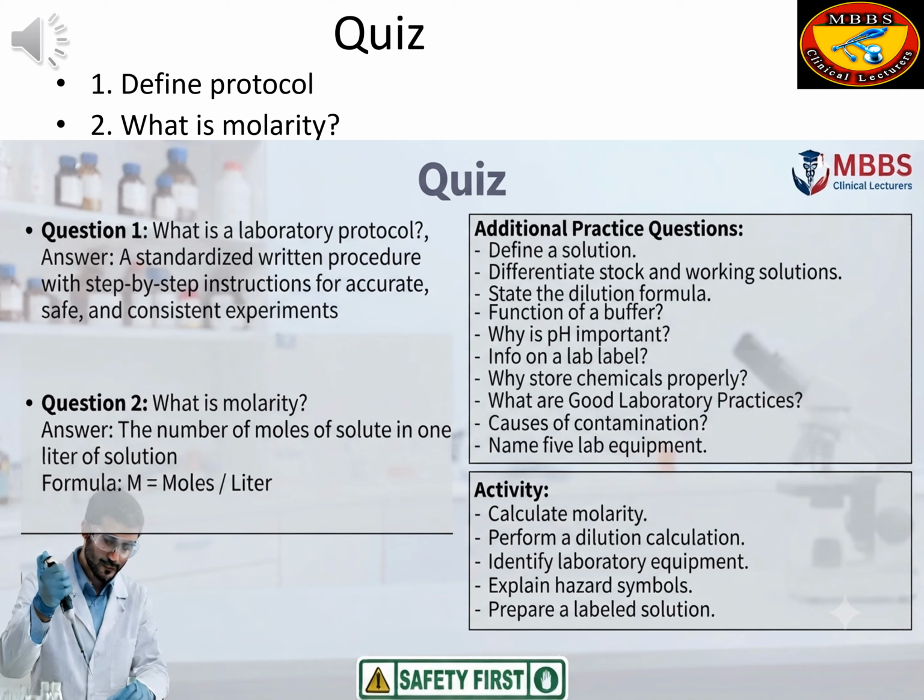Activity: ask students to calculate molarity. Perform a dilution calculation. Identify laboratory equipment. Explain hazard symbols. Prepare a correctly labeled solution. Key takeaway: continuous practice and regular review strengthen laboratory knowledge and practical skills.